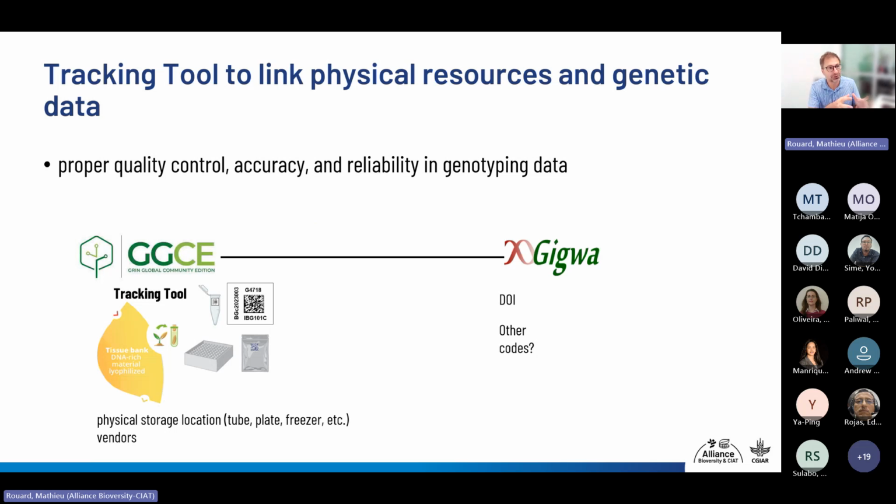I mean, some accessions are selected for DNA extraction, and I'm talking here in the digital gene bank in FutureSeed, and in front of me I have the lab where a lot of those extractions are being done, and there is a system in place to do this tracking, to have identifiers for different tissues, to track what happened with the DNA extraction, to whom it was sent, who was the vendor, and so on.